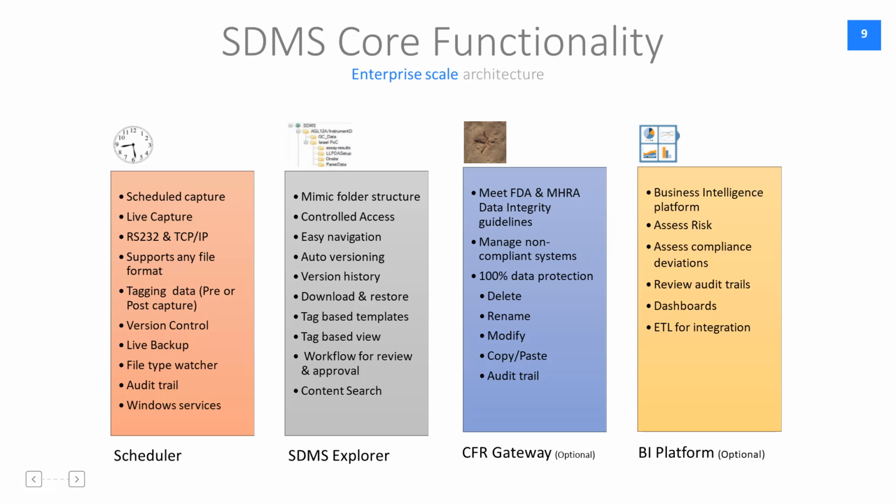LogiLab SDMS tag-based templates is also a very unique feature where you will be able to create templates based on your tags. That means you can have a meaningful way of viewing your data. The templates will help you in viewing your data in a more meaningful manner. Let's say for a quality control lab, you would like to view the data based on the product and batch number.